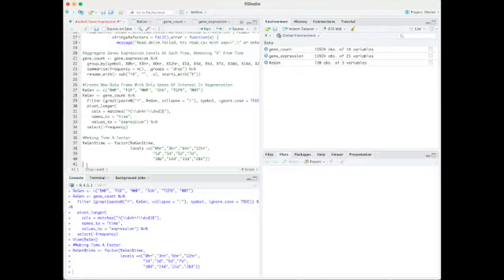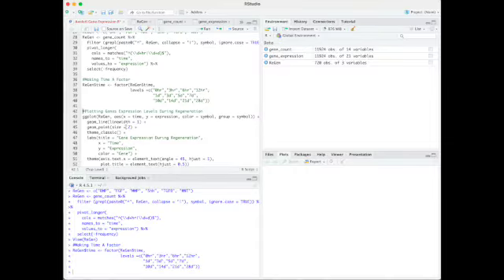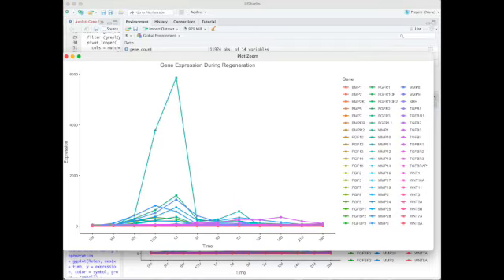To now visualize gene expression, we will use ggplot, which creates data visualizations, allowing us to better observe the data in our data frame. Here we are plotting all regenerative genes in our new dataset, Regen. This will output a line graph of all gene expression levels over the course of time they were measured in the dataset.